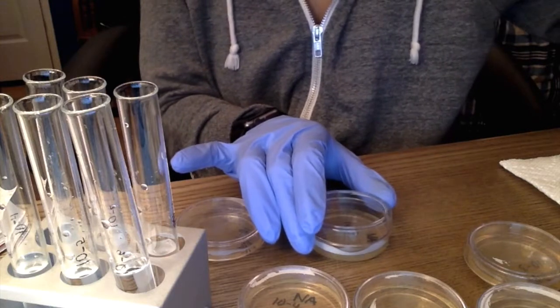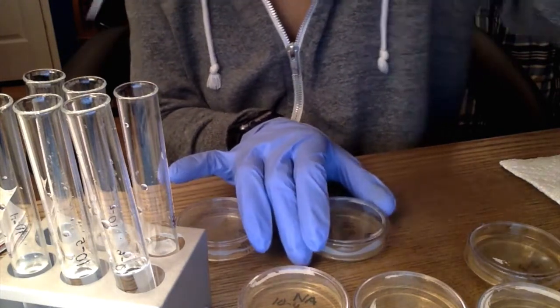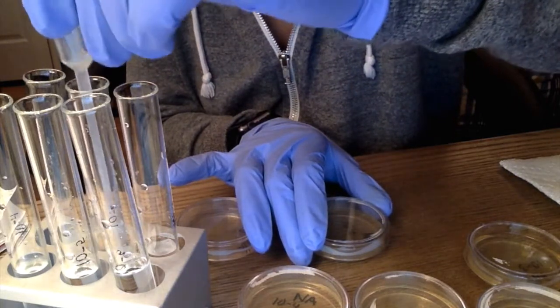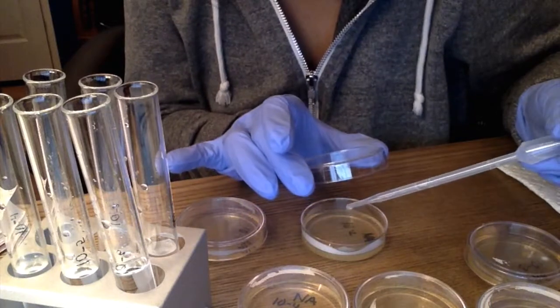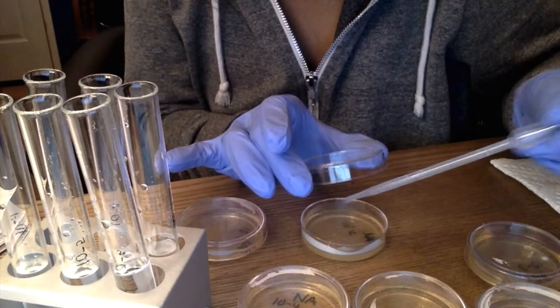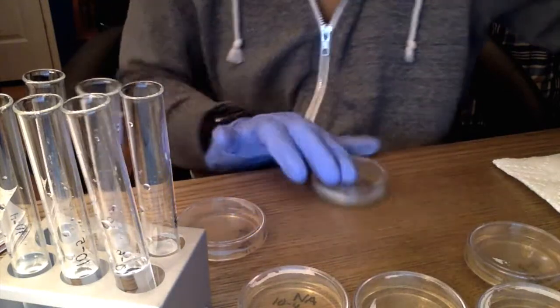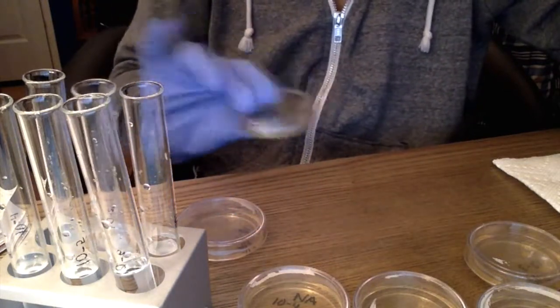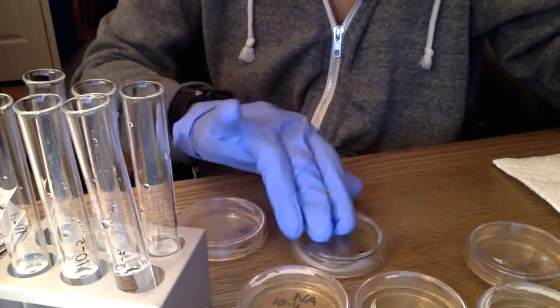Now I'll be doing about 4 drops of 10^-2 into the second agar plate. So like I said, that way later on I can tell which ones correspond with what. We'll get rid of all that solution. Swirl, swirl, swirl. Now this is part 1.